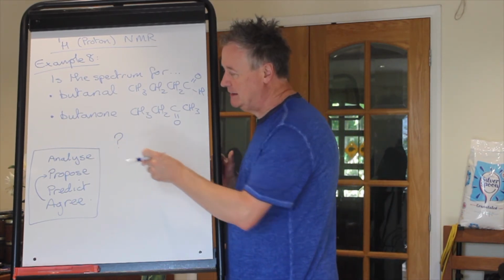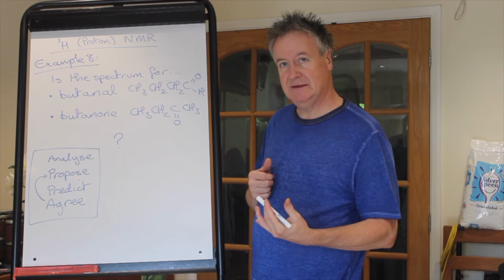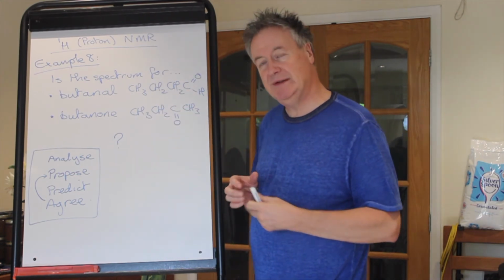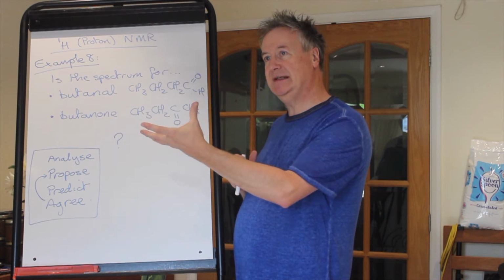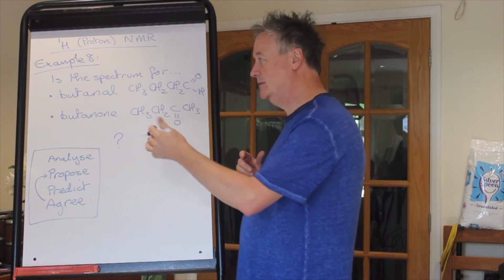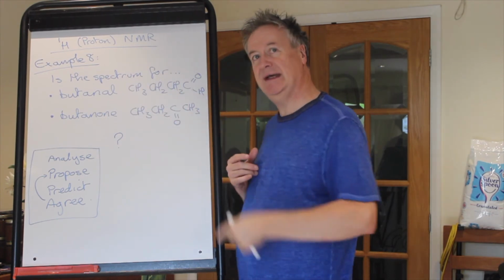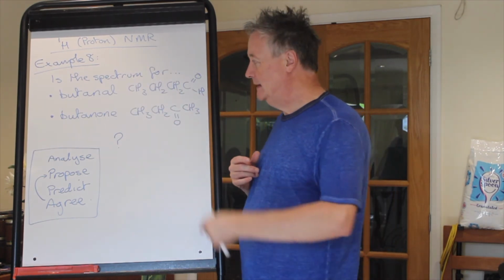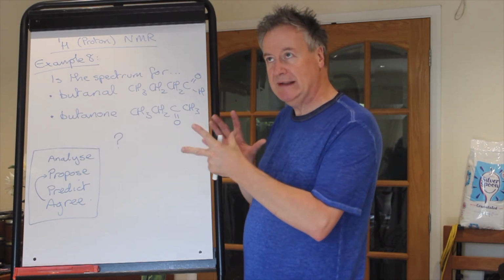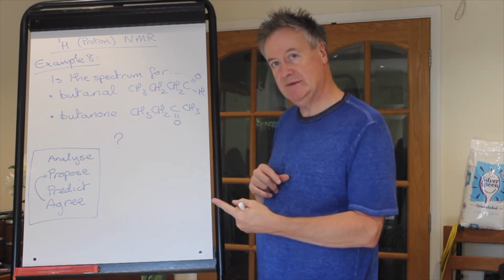So you need to be able to express how to analyse an NMR spectrum. Now, it's the reverse of what we've been doing. We've been giving the hydrogens letters and then saying what they would be. Now we're going to turn it inside out, and you're going to look at the NMR spectrum, put letters on the NMR peaks, and then analyse each peak or peak group at that letter for what it means.